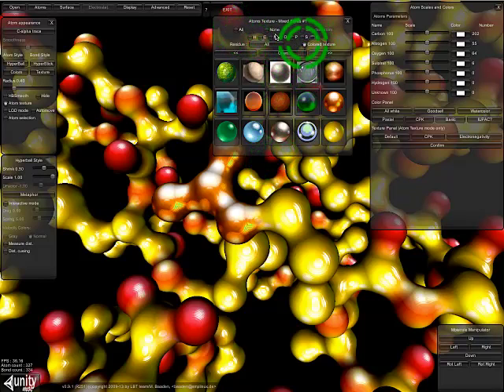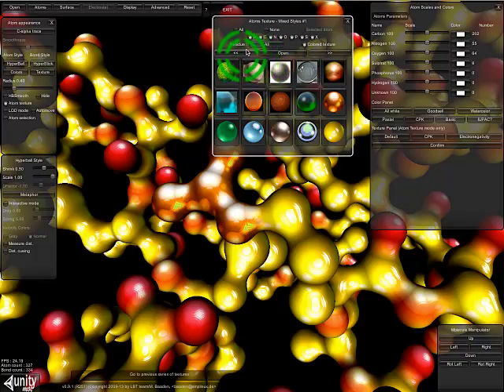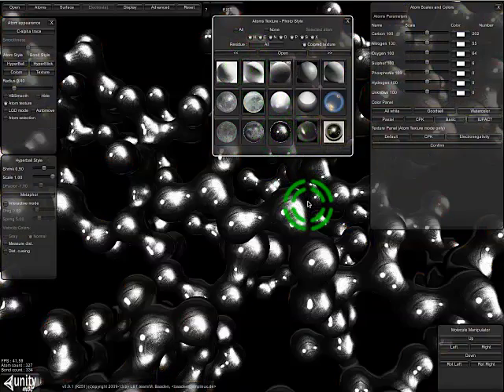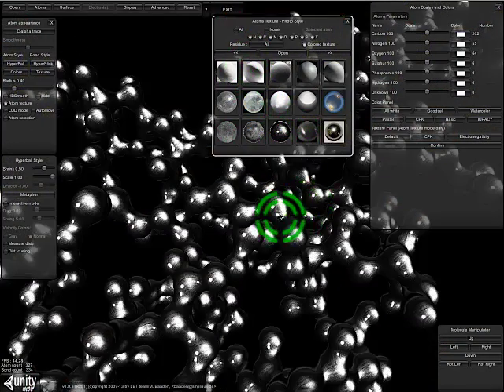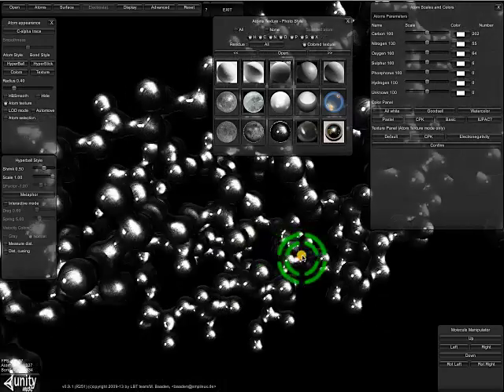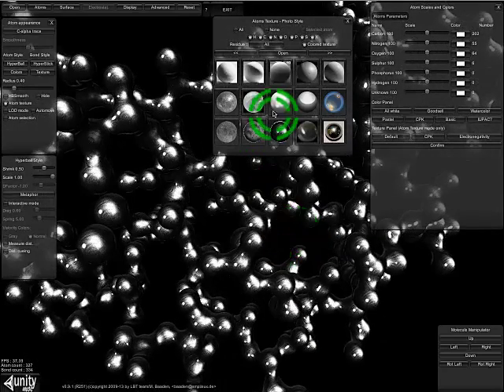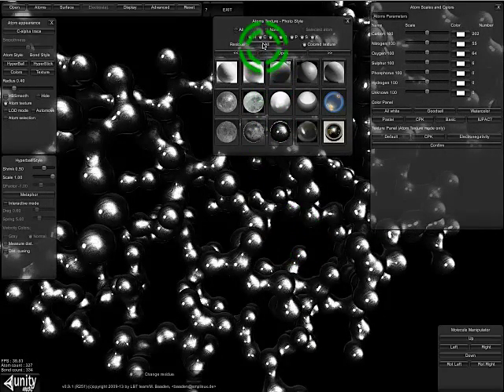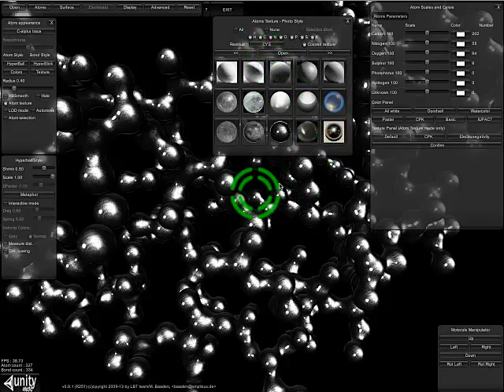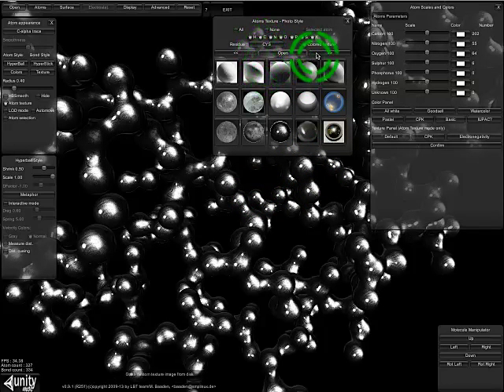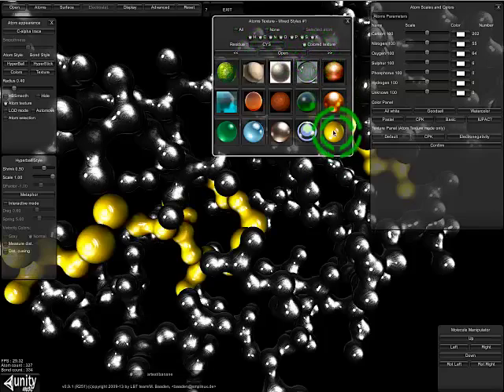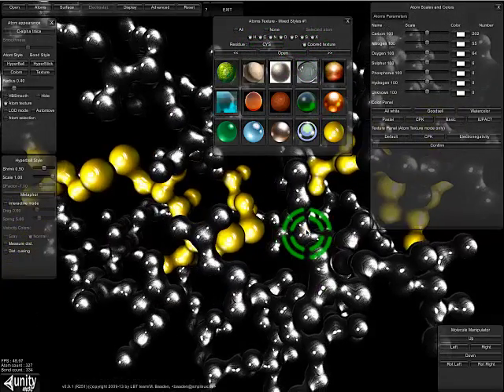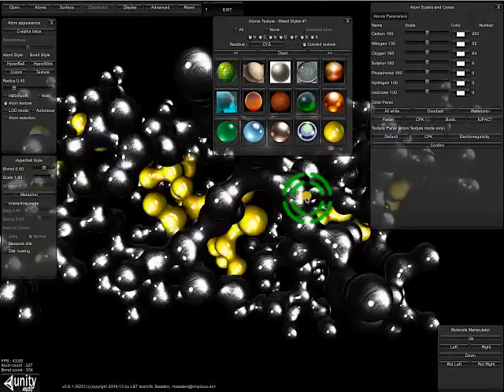Now let's use everybody again here, and then take a neutral background texture, maybe something like this, a metallic black-grayish one. Then let's highlight some residues. We can choose some residues. For instance, if I choose residue all and the cysteines, there are several in the system. Then I choose this yellow here. We will highlight all the cysteines in the system with a specific texture.